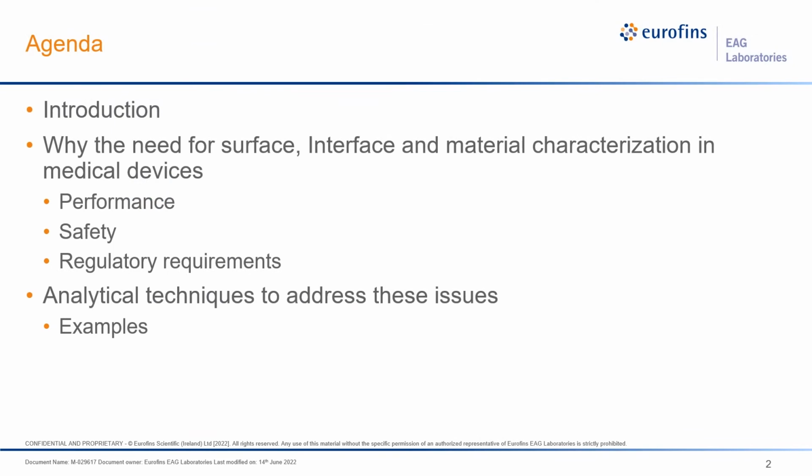I will start with a brief introduction to medical devices and then talk of the need for surface and interface characterization in these devices. These relate to performance, safety, and regulatory requirements. Along the way, I will discuss various analytical techniques with examples.